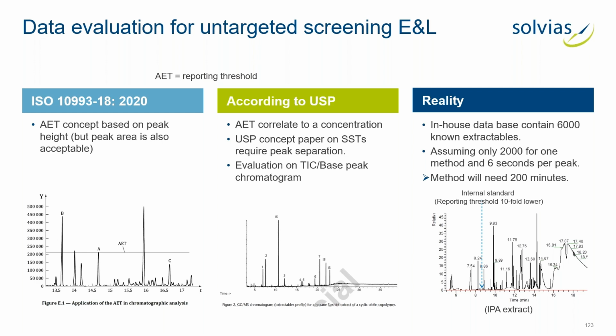So I have my problems to put both ideas together. Yes. Another requirement from the USP is, for example, that we get peak separations.